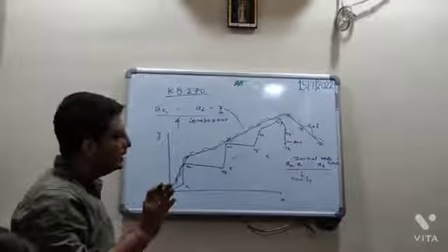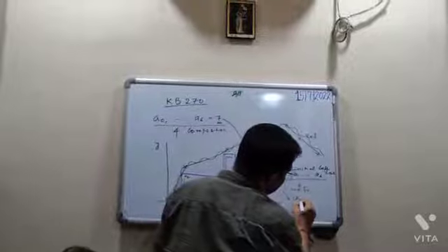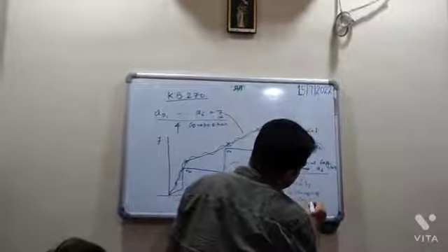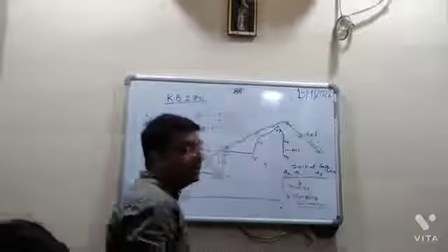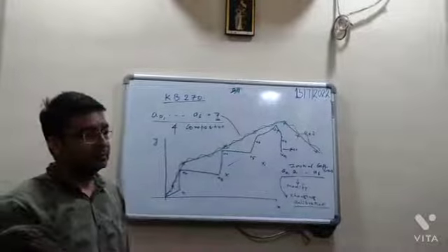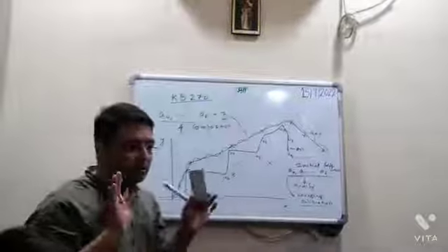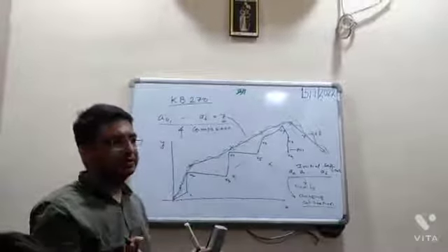Clear? And that's why these values are changing once you apply calibration. Why are these values changing? Because you are applying a calibration. Otherwise it won't change.